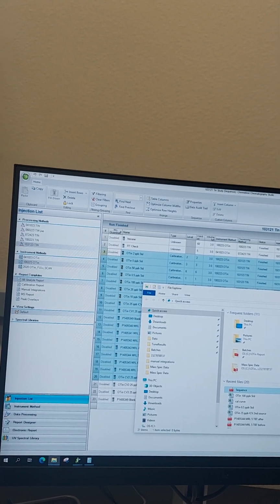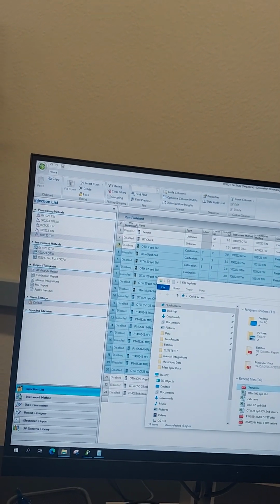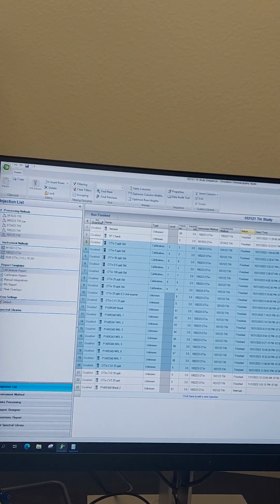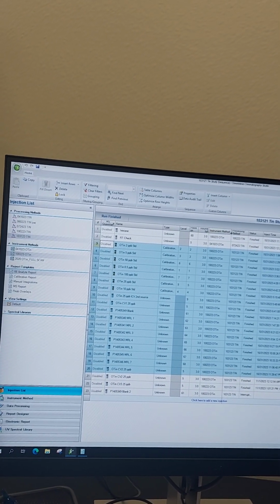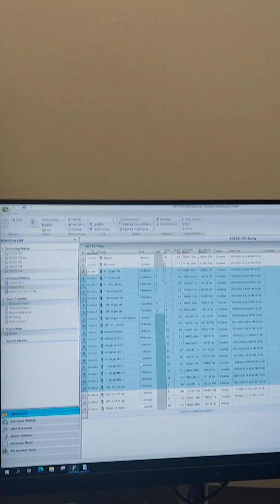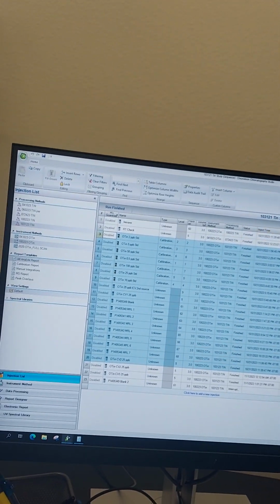GC parameters. I report that. GC parameters. I don't think we need to. Oh, okay. Then what else? It's a little smaller, so it all fits on one page. Calibration curve and everything is in the other files that we already did. Yeah.